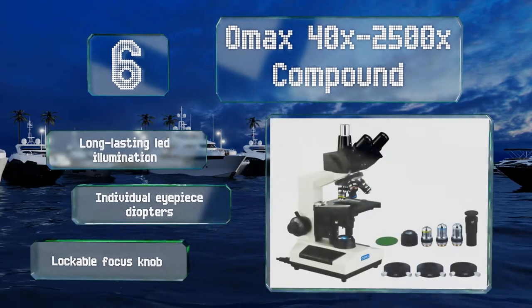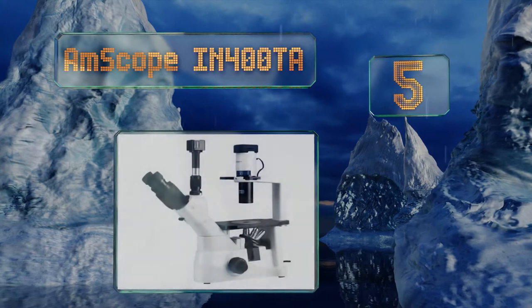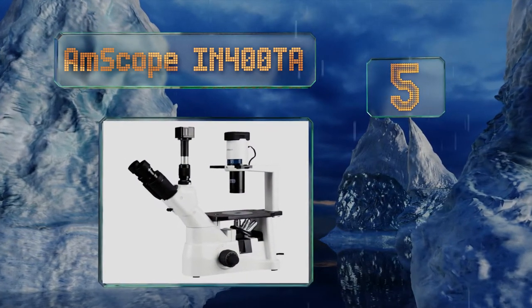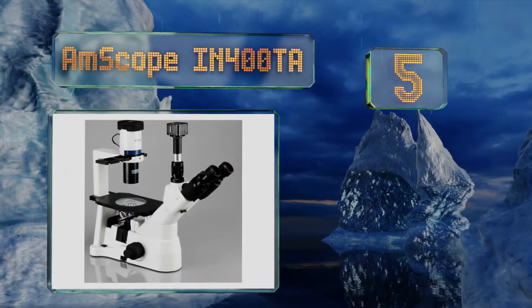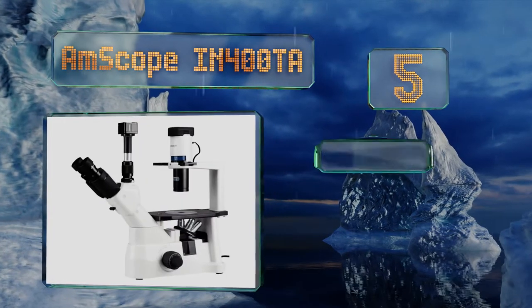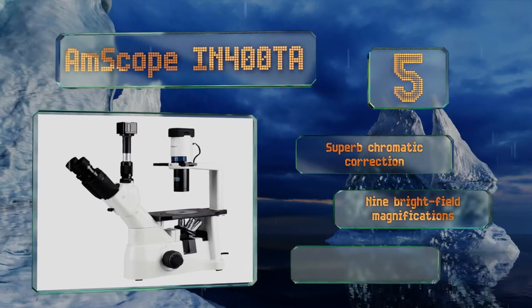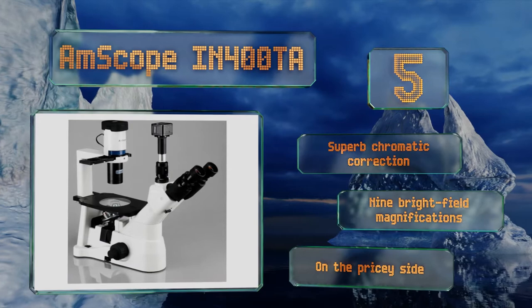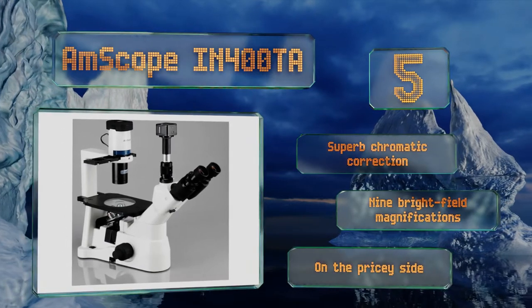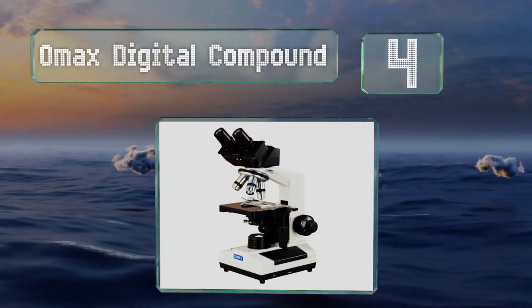At number five, thanks to its inverted design and its ability to stream live video to a PC, the AmScope IN400TA makes an excellent teaching tool for precise study. Though its lack of clamps or ruler markings on its stage make it somewhat less useful, it boasts superb chromatic correction and nine brightfield magnifications, but it is on the pricey side.